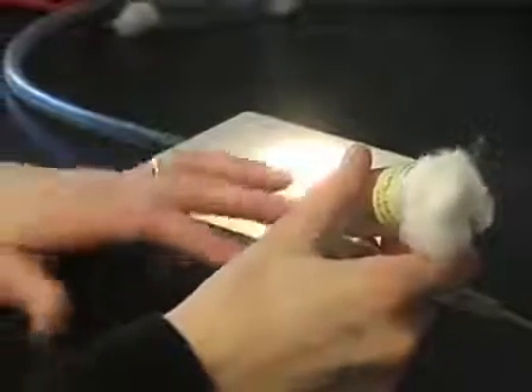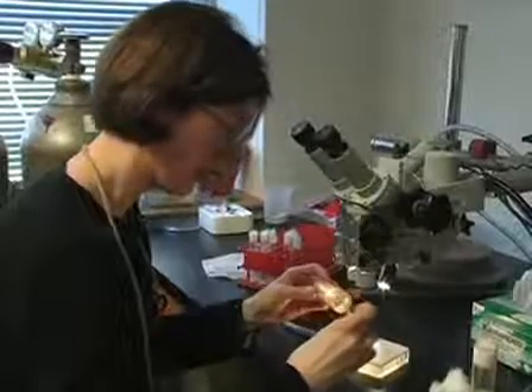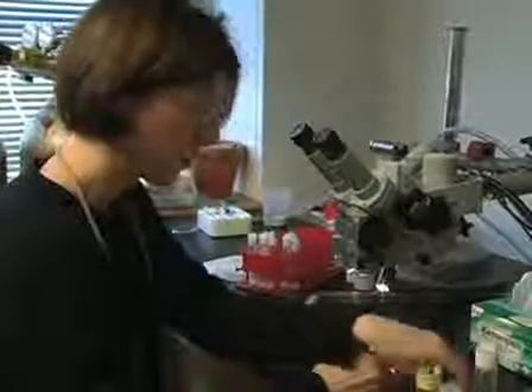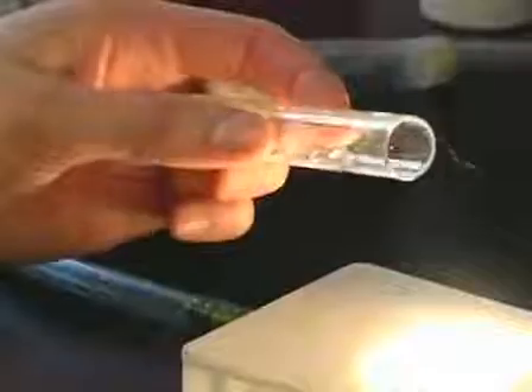The first step is to get socially naive flies — flies that haven't seen any other fly. To do that, we take late-stage pupae from the kinds of flies we're interested in, and we remove the pupae from the vial carefully with forceps. Then we take the prepared isolation vial, remove the cotton, gently place the pupae inside, recap it, and label the vial.